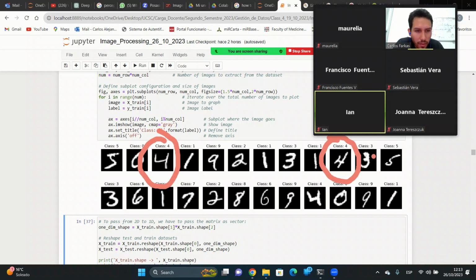And then you will have the 3 and the 5. This looks pretty much like my 5. If you close here, it will be a 6 for some people. For me, it's still 5. The 6 here for me is like this. Okay. Then you have class 3, 6, 1, 7. It could be 1 here. Not so much difference here. 2, etc., etc., etc.